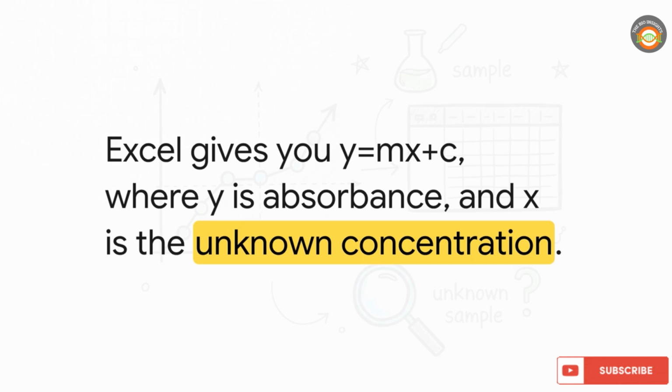When you checked that display equation box earlier, Excel gave you a raw output looking something like this: y = mx + c. Let's visually break this down so it's crystal clear. Y represents the absorbance reading you already have in your hand. X represents the concentration. That's the unknown piece of the puzzle we're hunting for. M is the slope of the line, and C is where the line intercepts the axis.